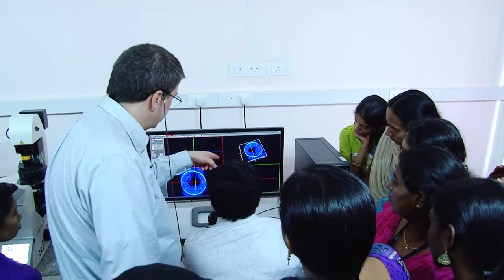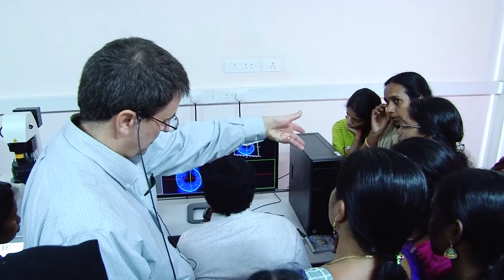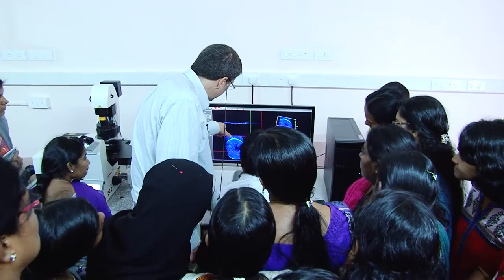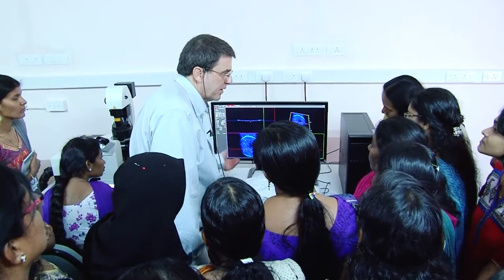Okay, so what is he doing now? He's doing a 3D projection or a 3D rendering, right? And you think, oh, this might be co-localized. And you look at it in 3D here, you see where the green and the blue are overlapping, and yeah, they're probably in the same place, okay?